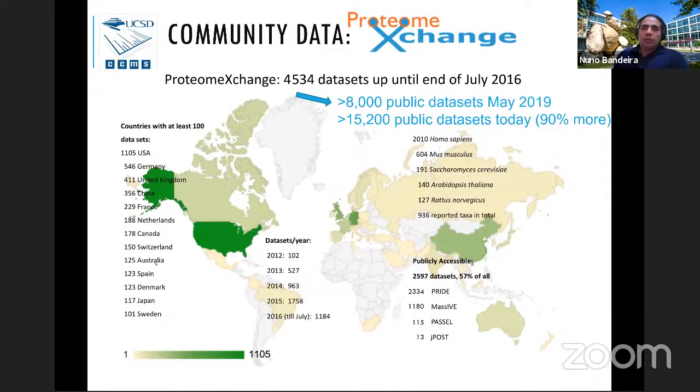So you might have seen this from the outside. Know that there is a ProteomeXchange consortium that is now pretty well known in terms of data deposition, that when papers are published, data has to go somewhere that is independent of the researchers that derive those data sets. And this was started about 10 years ago. You can see that this slide, which I keep at this point for historical reasons, in terms of how things were in 2016, 5 years ago, that we can see then in contrast to that, what does it look like today?